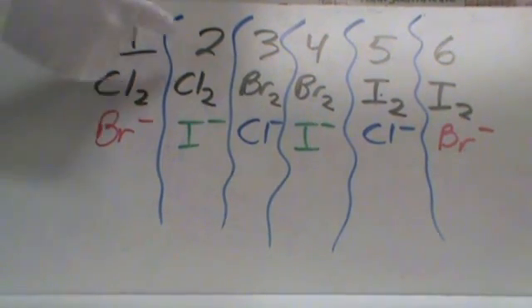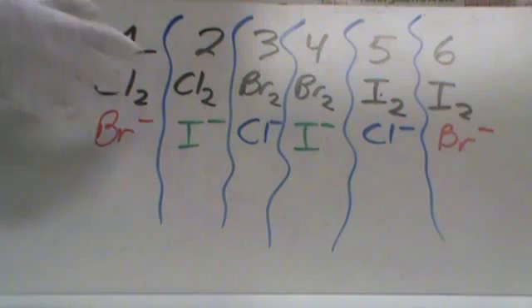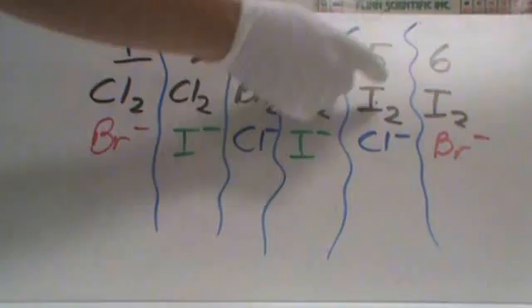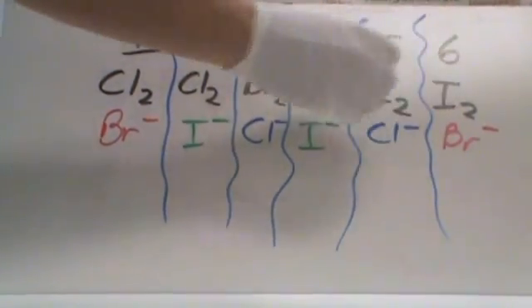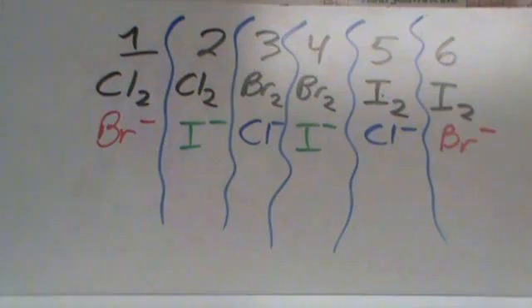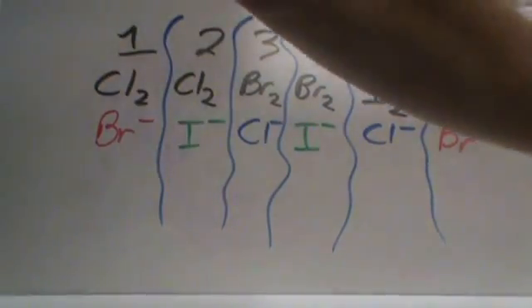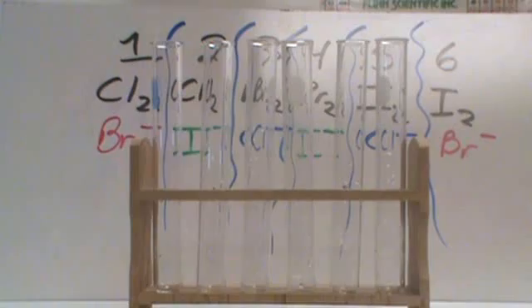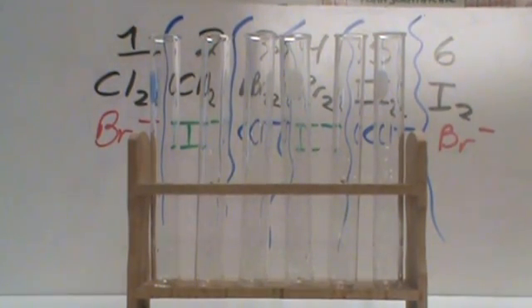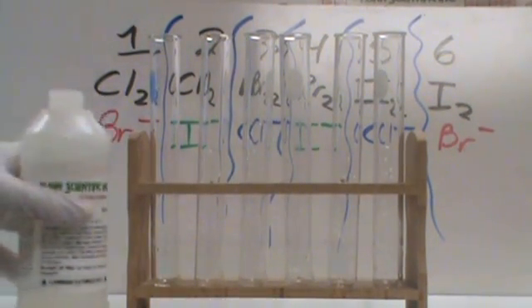With chlorine, I'm going to mix sodium bromide and also iodide in the second test tube. In the third and fourth, I'm going to mix the bromine with chloride and bromine with iodide. In the fifth and sixth, I'm going to mix iodine with chloride and bromide. I want you to pay attention to whether or not it reacts. Here are our six test tubes. We're going to have an aqueous layer and a layer of hexane.